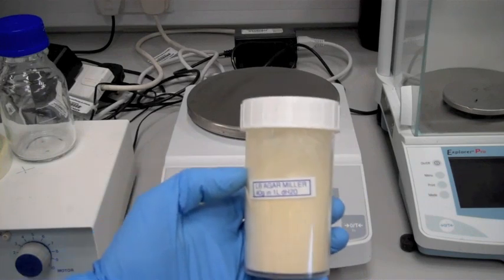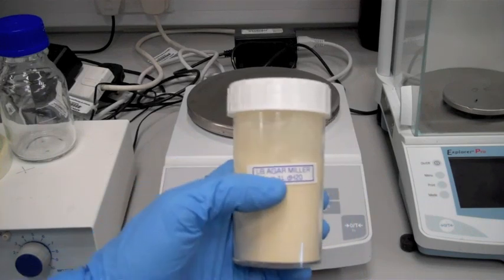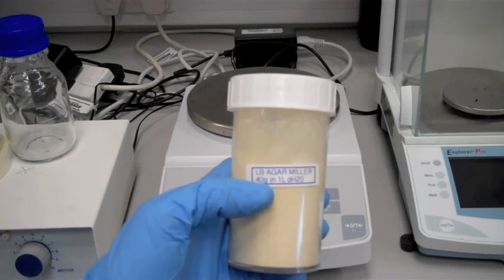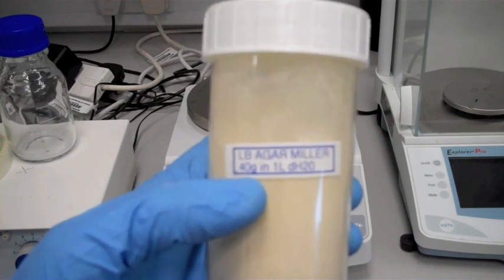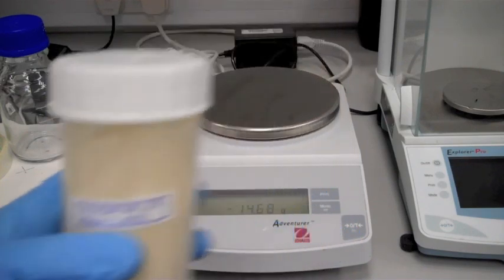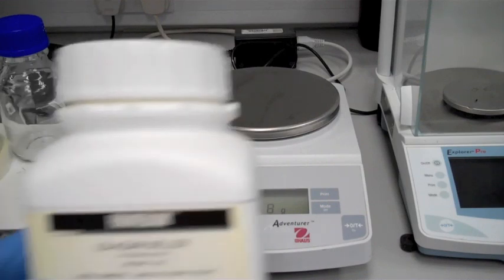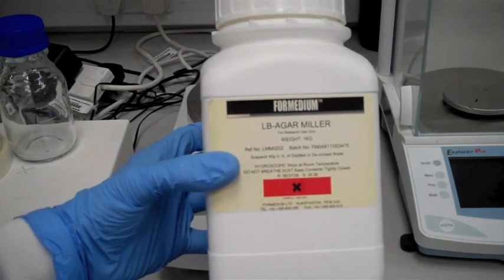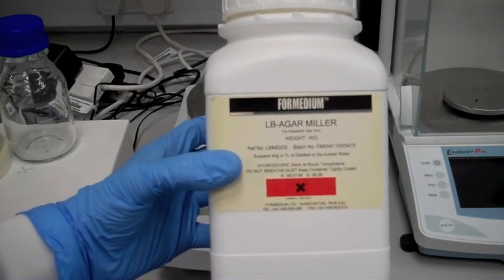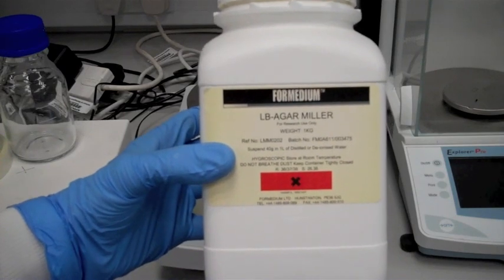The media is in these bottles. It's been labeled LB Agar Miller, and it tells you the amount required in one liter. Forty grams is required in one liter. The stock bottle is made by Formedium, and that's the bottle that it is contained in. So the information is there if you require it.